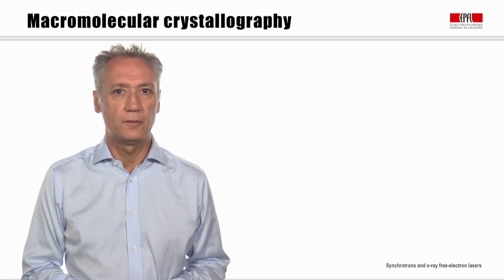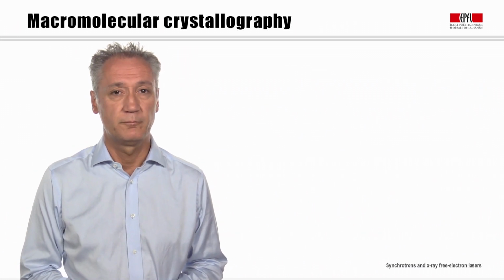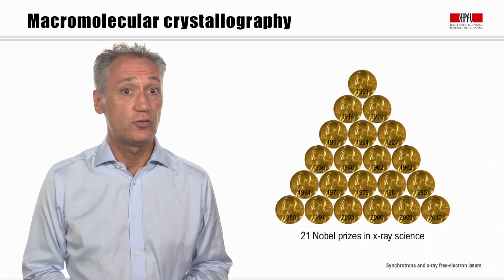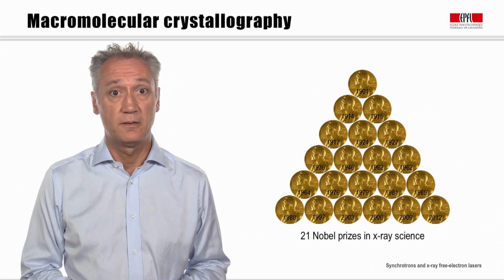We finish this video with a brief description of macromolecular crystallography. A young and ambitious student contemplating which line of research to pursue for a PhD program could do worse than choose macromolecular crystallography, or MX.